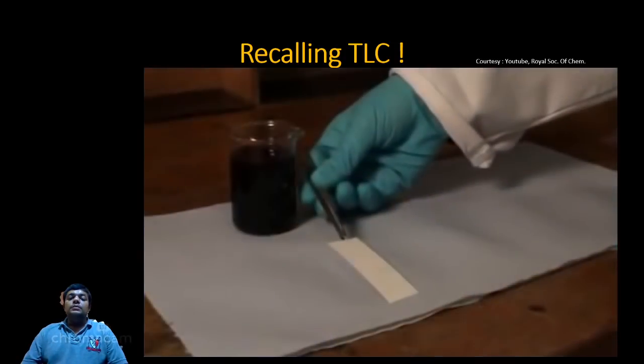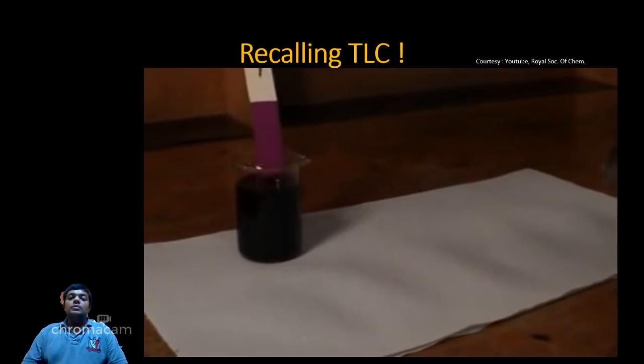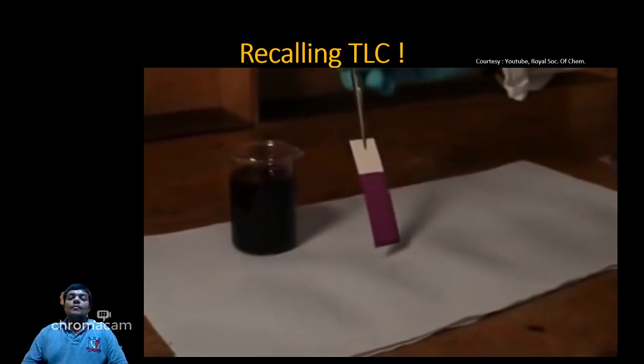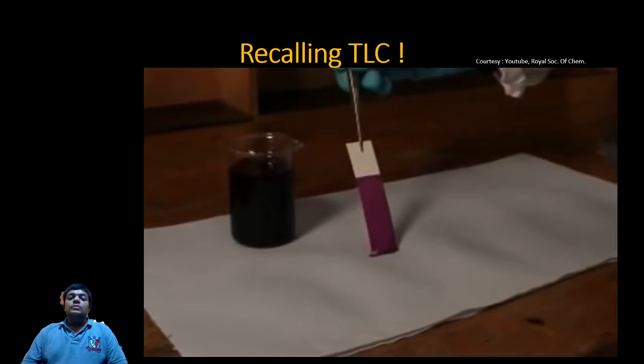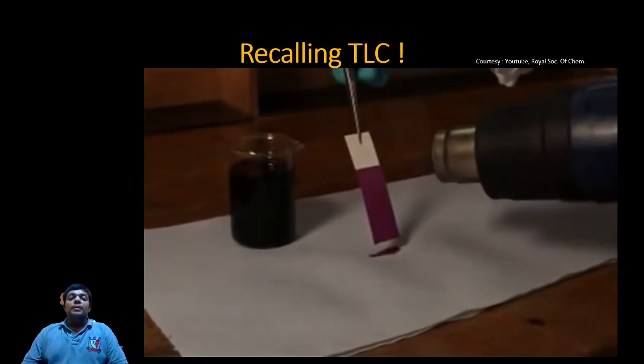A range of chemical dips can be used which react with certain functional groups producing a colour change, for example potassium permanganate. Why is this chemical dip done? Sometimes if you don't get the spot clear, you go for a destructive method of visualization instead of the non-destructive one. If it is dipped in iodine solution or potassium permanganate solution, it will undergo a redox reaction and the spots will appear.